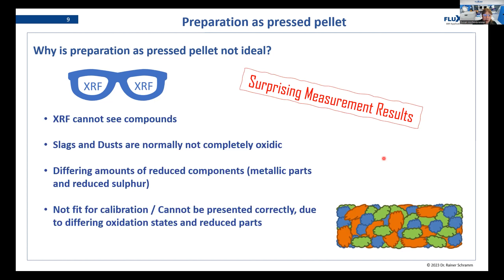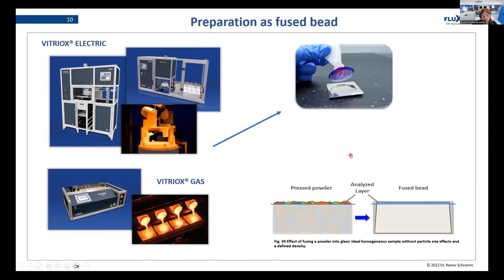At some point it might happen that your pressed pellet gives measurement results that do not really fit your routine measurements. As soon as you are out of this routine and outside of your calibration range, and as soon as they are different from what you are measuring on a daily basis, it might happen that they do not fit into your calibration anymore and the whole thing cannot be presented correctly due to the differing oxidation states and reduced parts, meaning your measurement results will simply not be true.